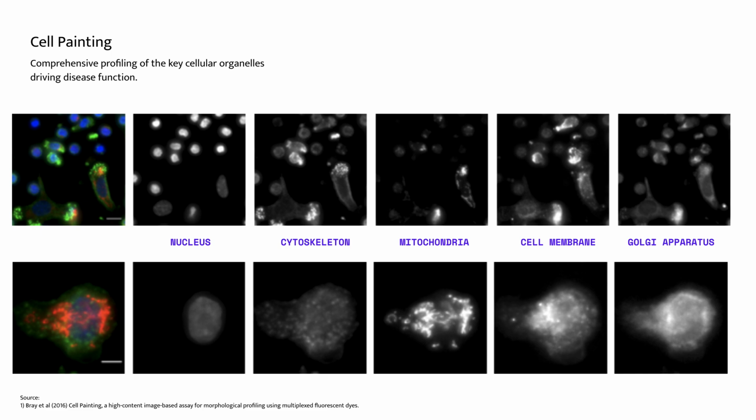To answer these questions, we use the cell painting assay. Cell painting allows us to profile the key cellular organelles and understand the viral immune response at scale.